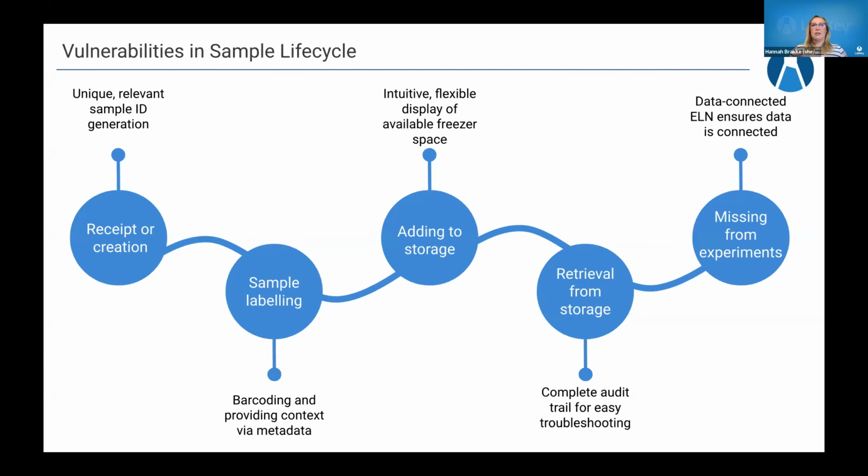And then lastly, as you're rounding out experimental data or preparing reports for INDs or IRB submissions, if your experimental data isn't capturing all of that metadata about the samples, it's very easy to then lose that sample's context and not have those be usable in the future.